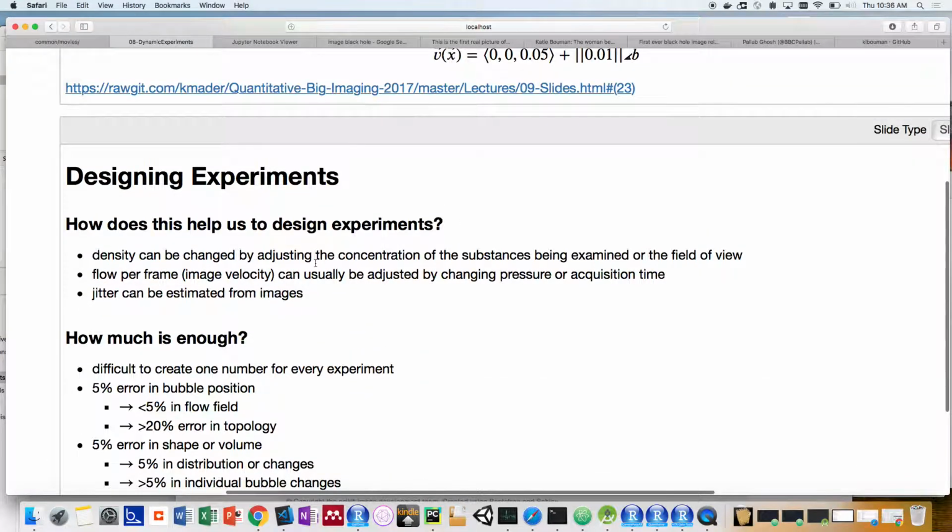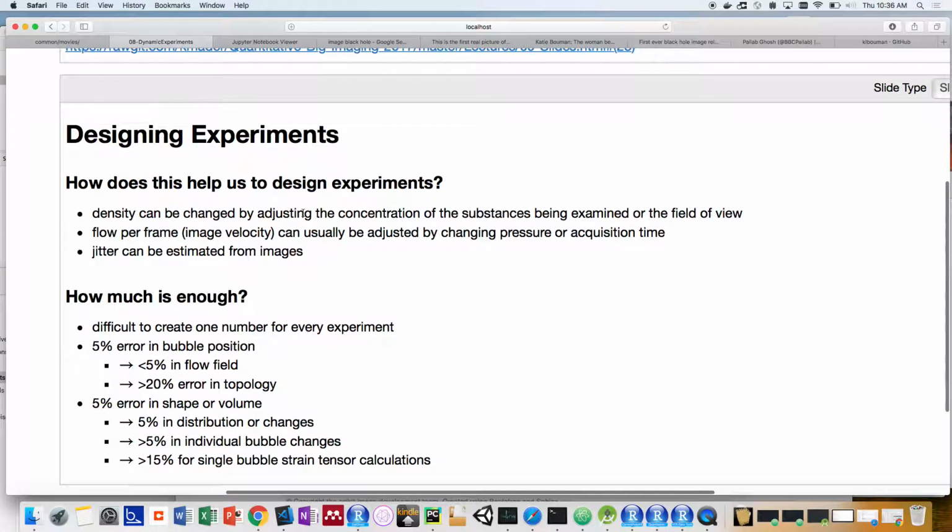Also, with the experiment design, nearest neighbors seems like a very simple tracking method, just finding the nearest one. But it's actually a great starting point, and it allows you to build experiments so that even if your simulations aren't quite perfectly matching what your real data look like, you can always make your tracking method better.